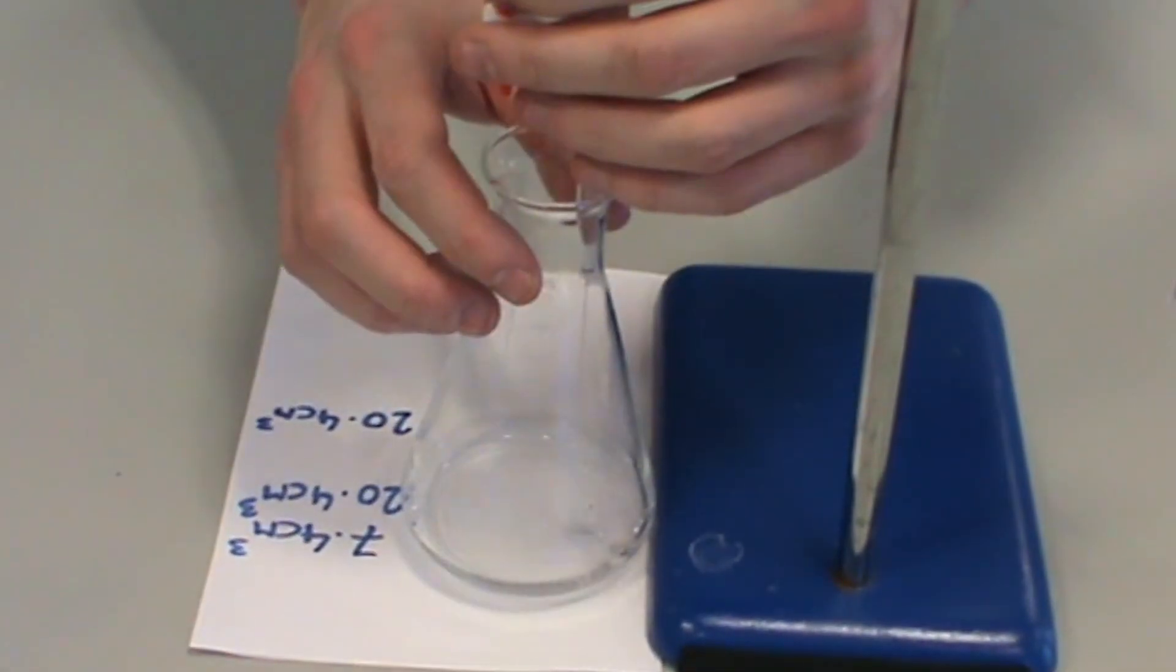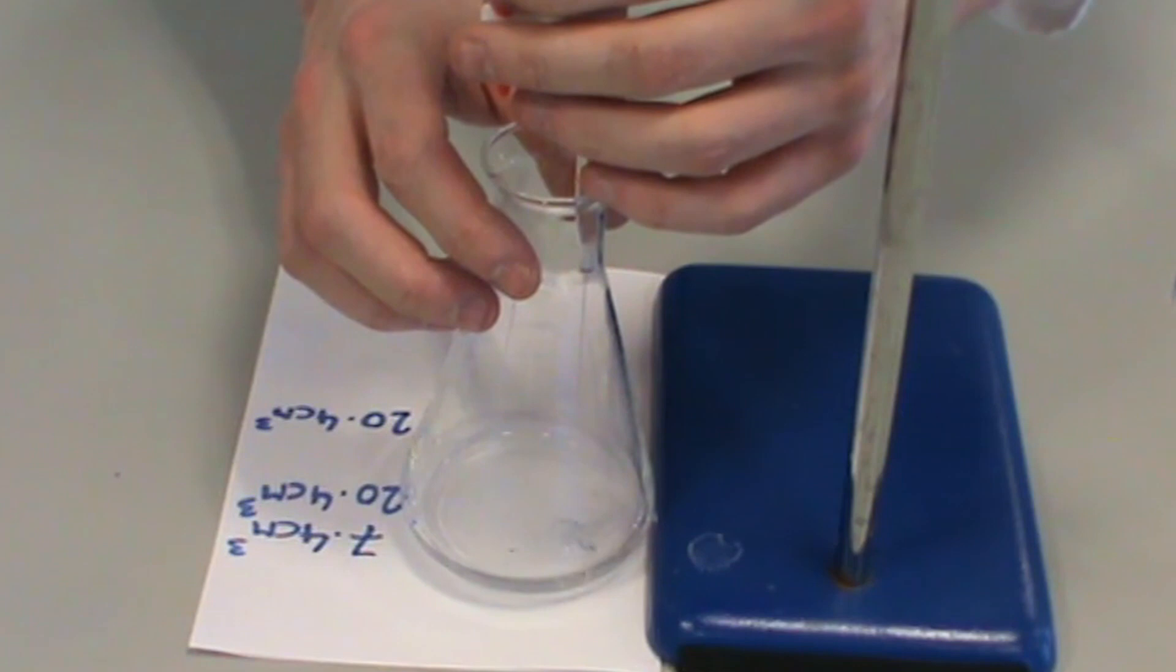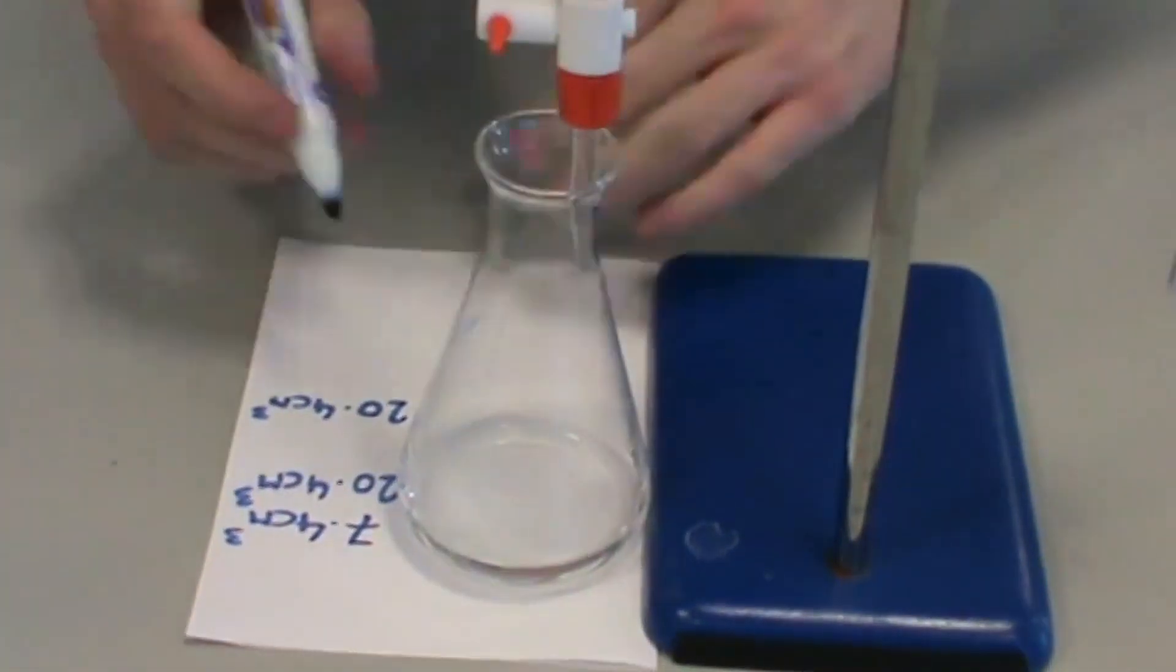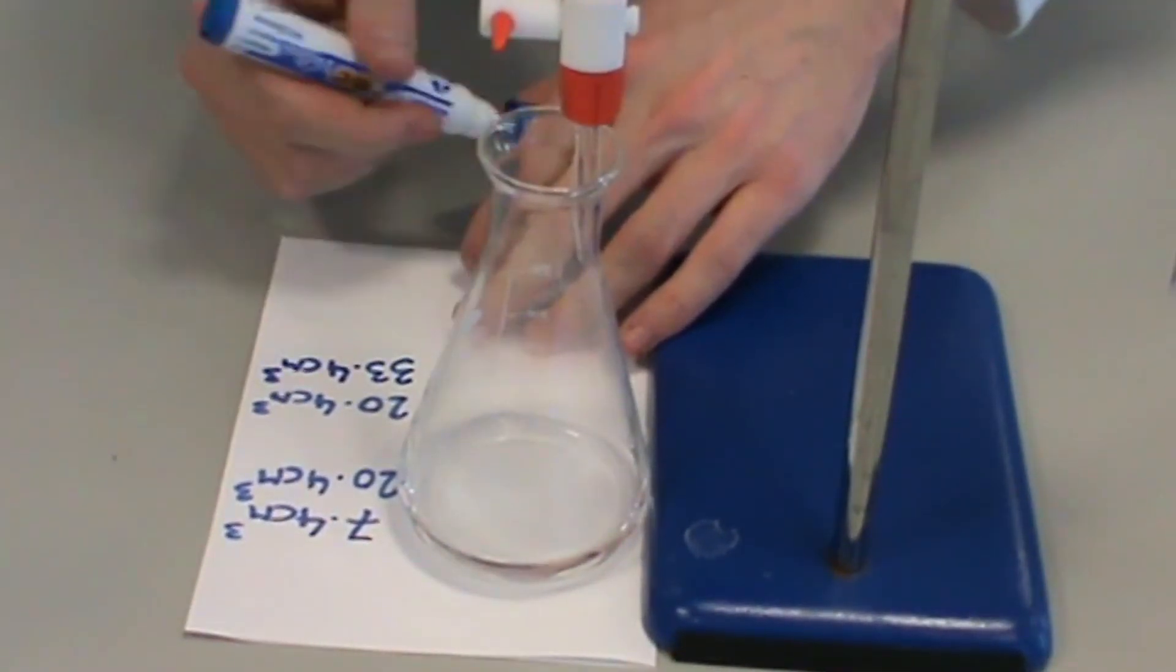Place the conical flask under the burette and note the initial burette reading. Now run the same volume of acid into the conical flask as when you did it the first time around. This ensures you have added enough acid to fully neutralise the sodium hydroxide solution.